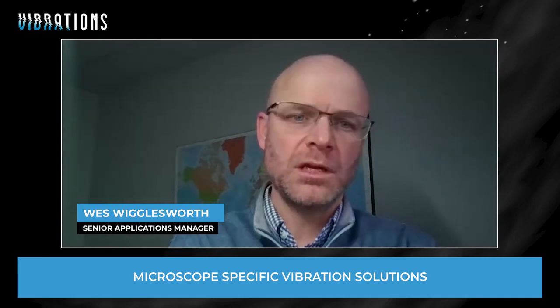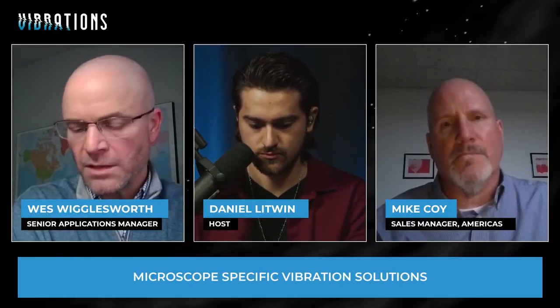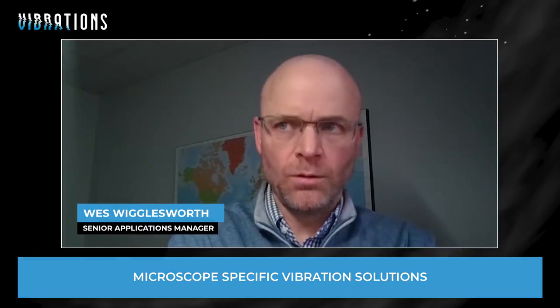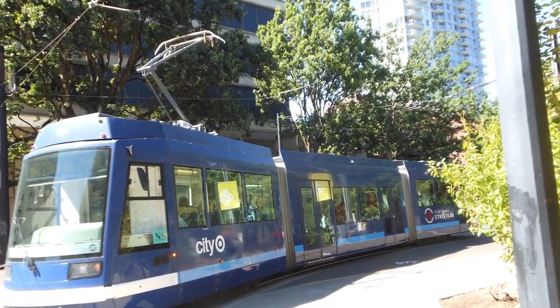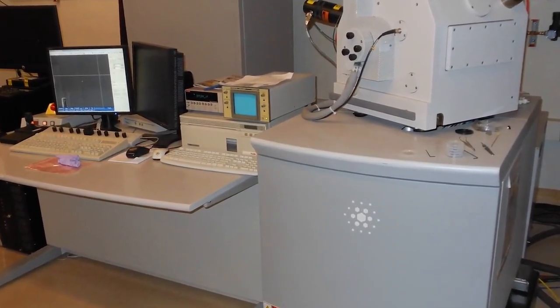Yeah, it actually comes up quite often. One case I really enjoyed working with the customer on was they had an imaging suite in the city in Portland. Oftentimes the universities are in cities. It's where all the activity is. It's where they want to be. And we had a customer who, and Mike mentioned sample prep earlier, had an FIB tool, focused ion beam tool, that was being used to prepare a sample. And every time the streetcar went by, it ruined it. It basically flew off the sample and ruined the sample prep.